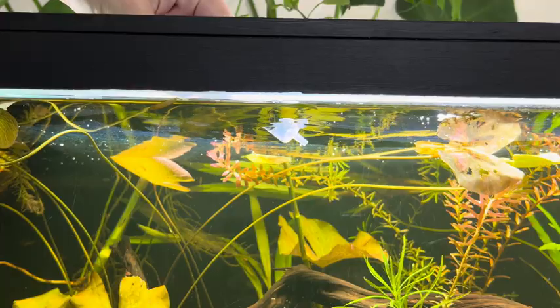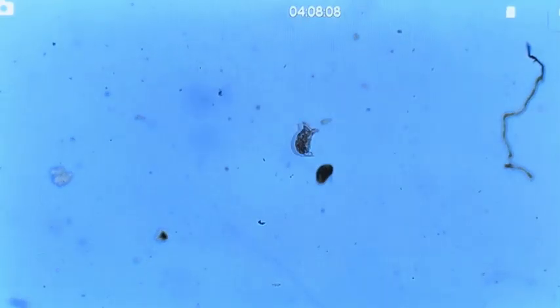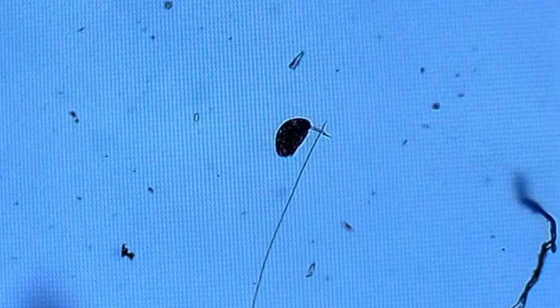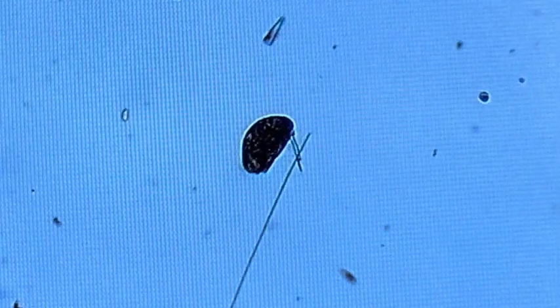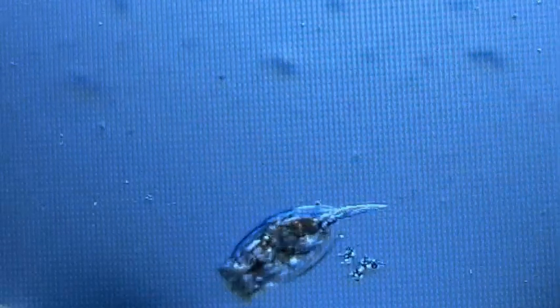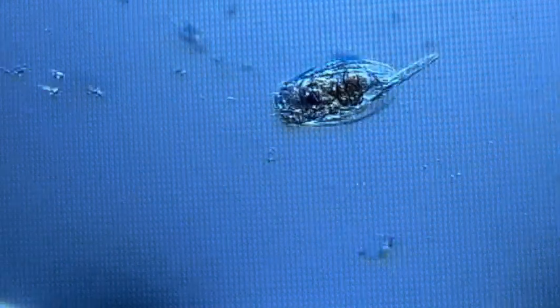I'm curious about what we will find on the surface of the water with biofilm. Here, we have a rotifer and an ostracod side by side. The ostracod seems to be holding something with its antennae that I can't identify, and it seems to be feeding on it. The organism you see here is called a rotifer. They have a complex, segmented body with a head, trunk, and tail. Their most distinctive feature is the corona, a crown of ciliated cells at the head end that they use for feeding and locomotion. Rotifers use their ciliated corona to create a vortex of water, which helps them capture and ingest tiny particles such as algae, bacteria, and protozoa.